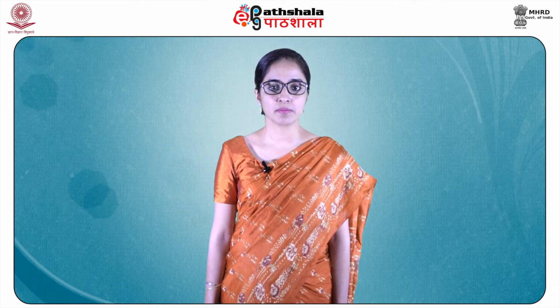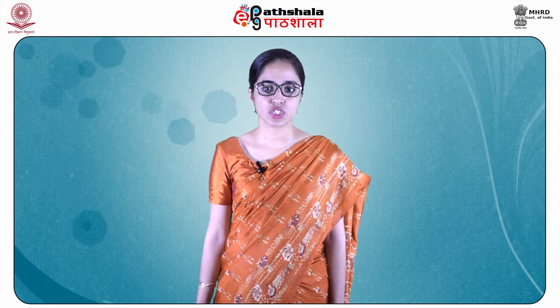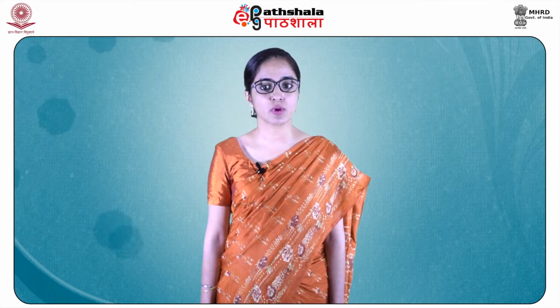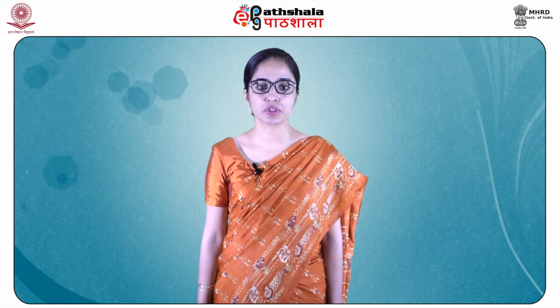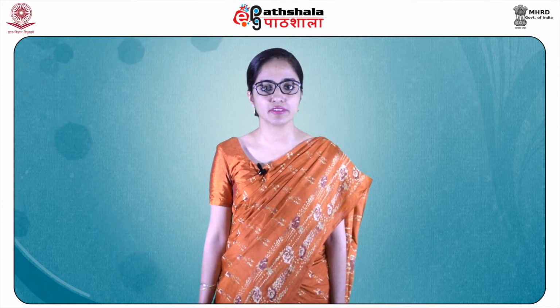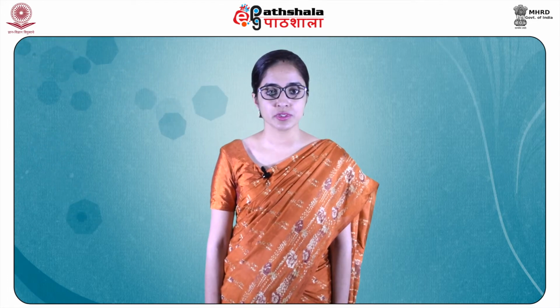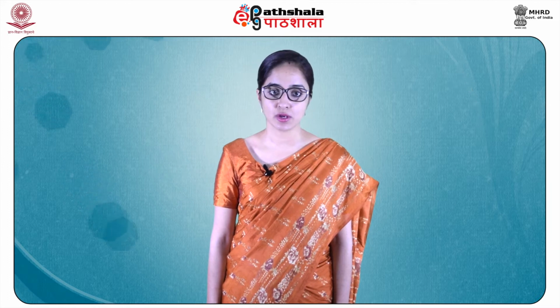Mass spectrometry is also used for other organic and inorganic compounds, in order to segregate ions by their charge to mass ratios and also for their qualitative and quantitative detection by their m/z values. The m/z values are also very helpful in finding out the relative abundances of the isotopic patterns of compounds. Now students, I would like to tell you the order in which mass spectrometry is carried out in the instrumentation.